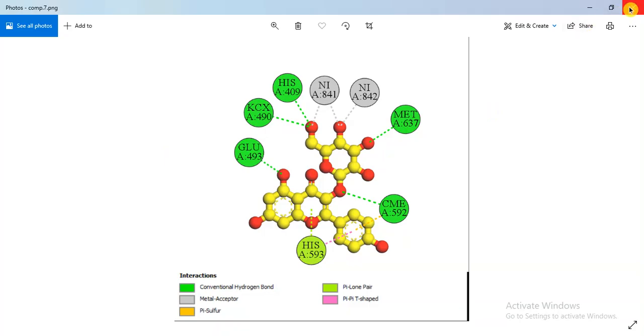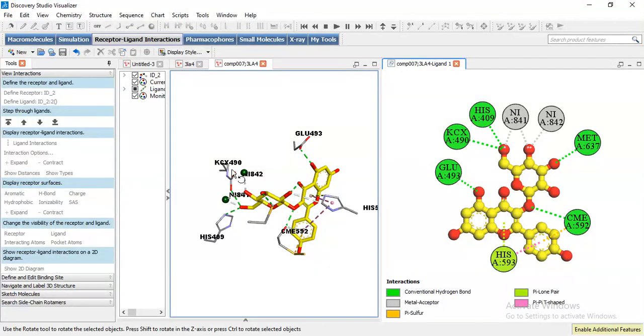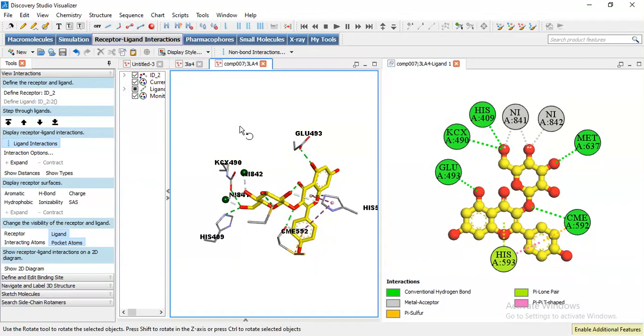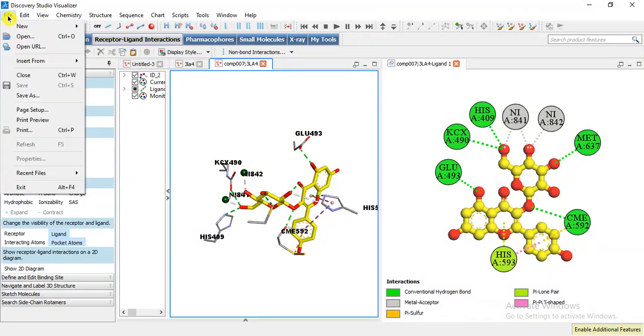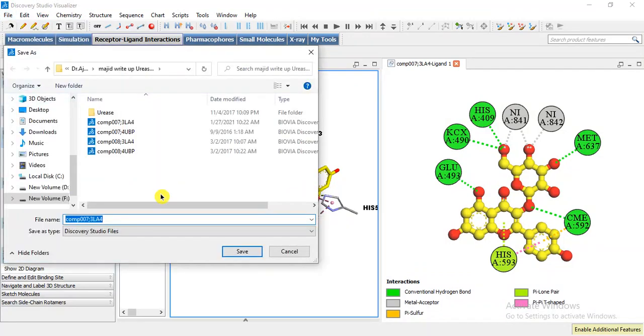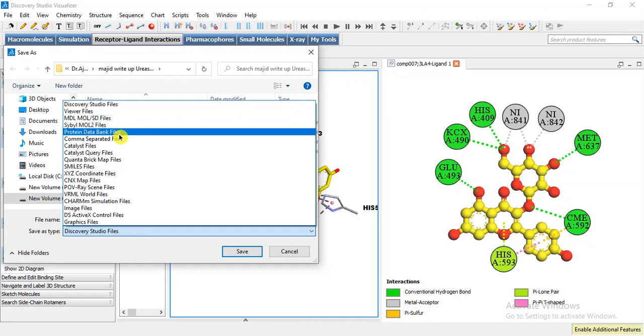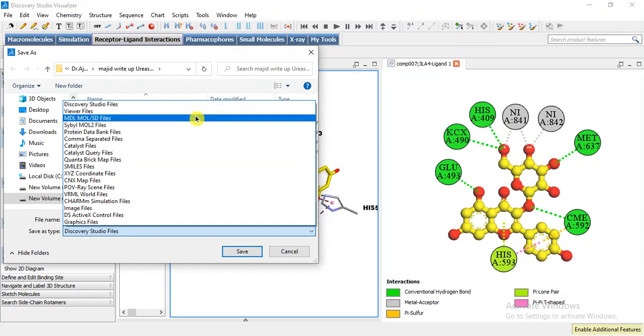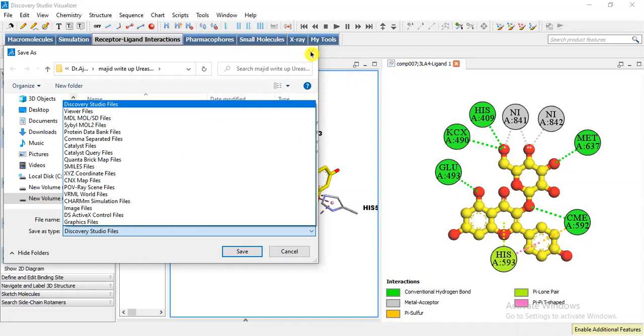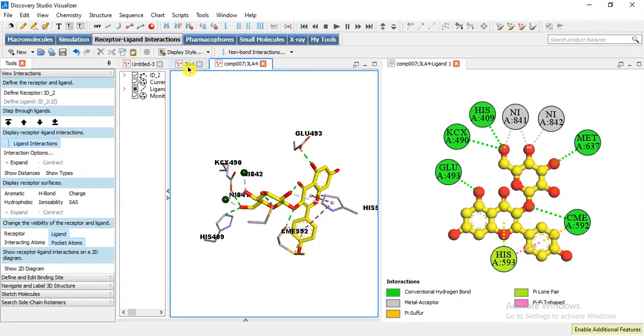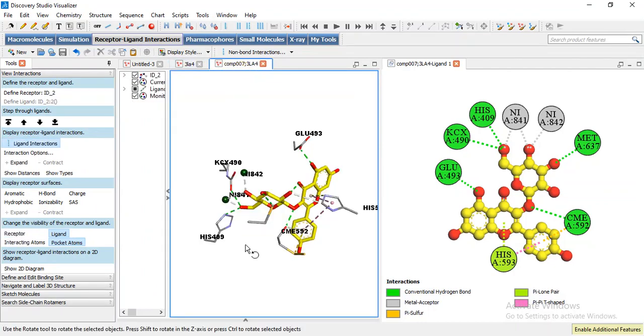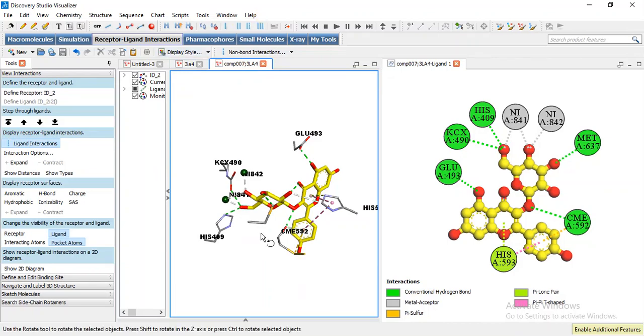You can also save this 3D file in different formats like DSV Discovery Studio file format, or we can save it as MOL2 file or PDB file. MOL2 file and PDB file can be used to open in Chimera or Molecular Operating Environment or other software. But in this case if we are going to save it in MOL2 or PDB file, then when we open it, it will be shown as ribbon model of the protein and it will not show the interaction that you saved previously. So if you are going to save it in DSV file then it will show this.